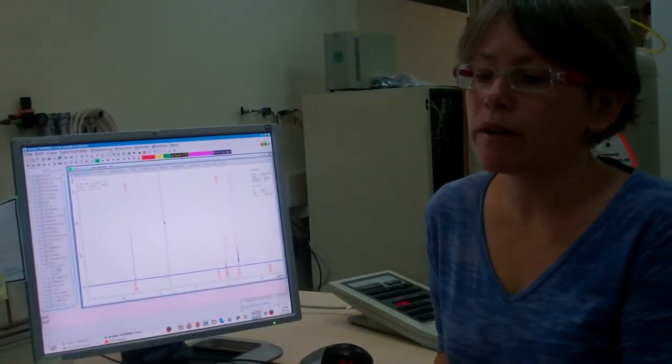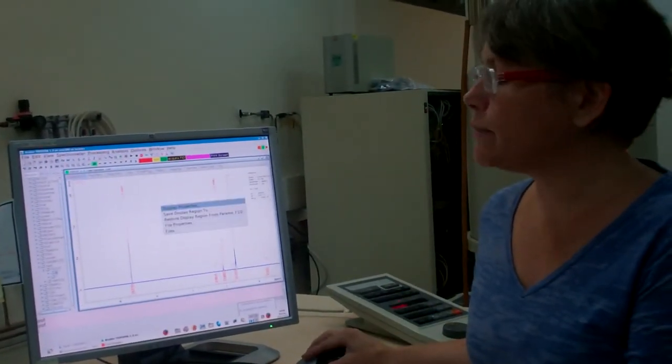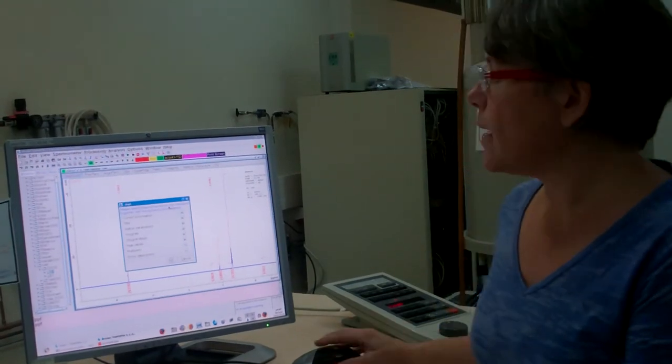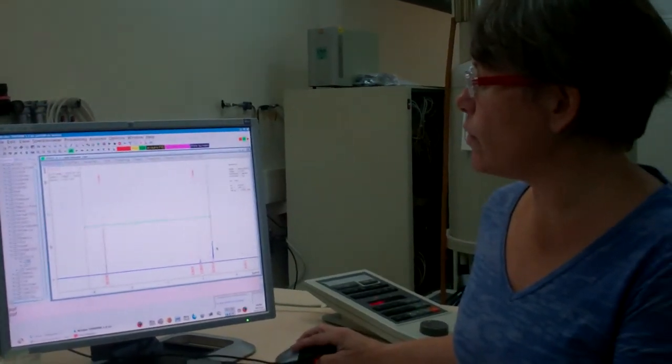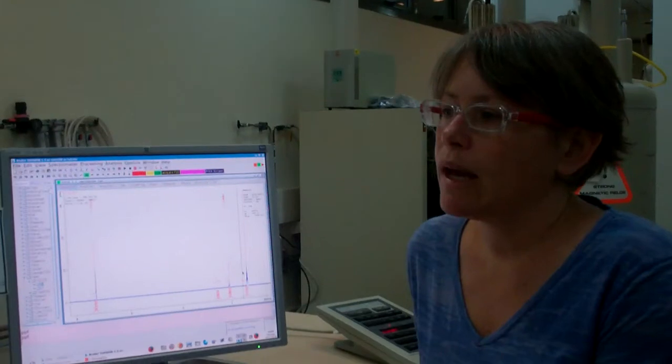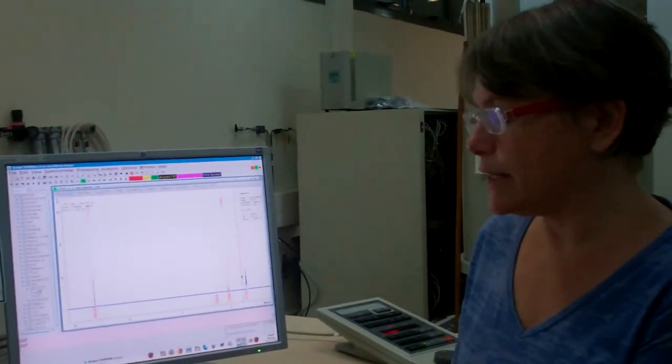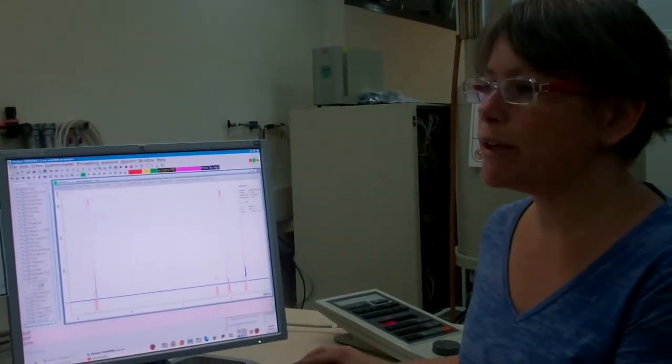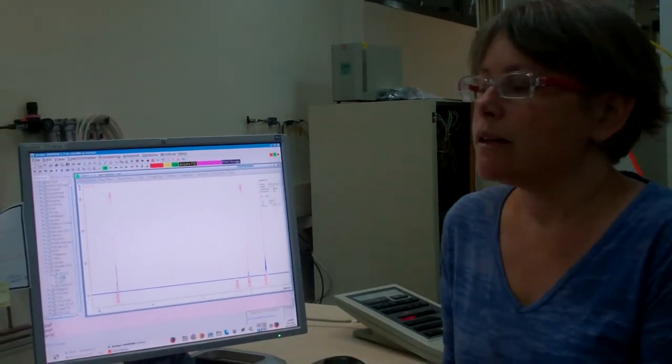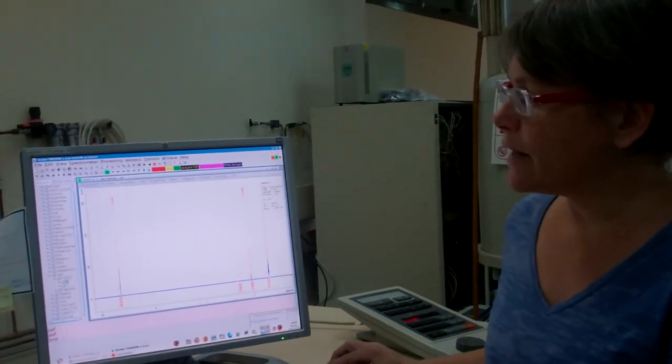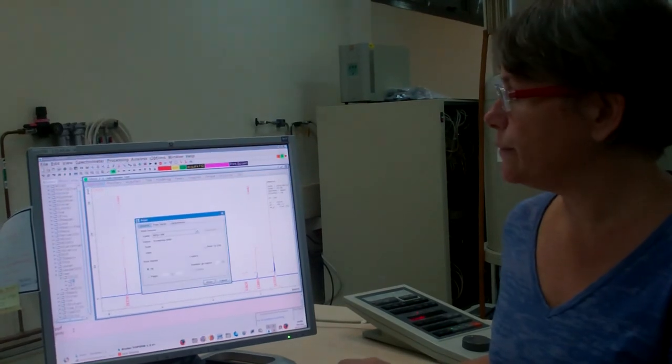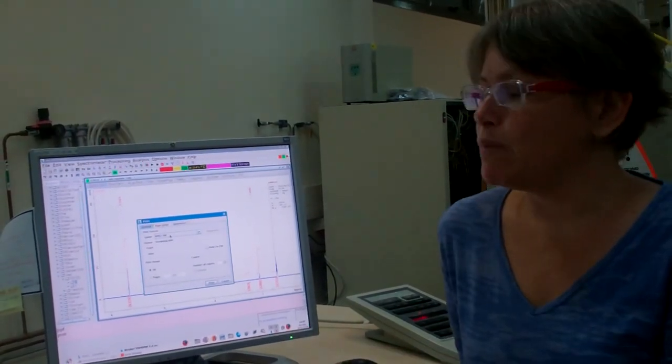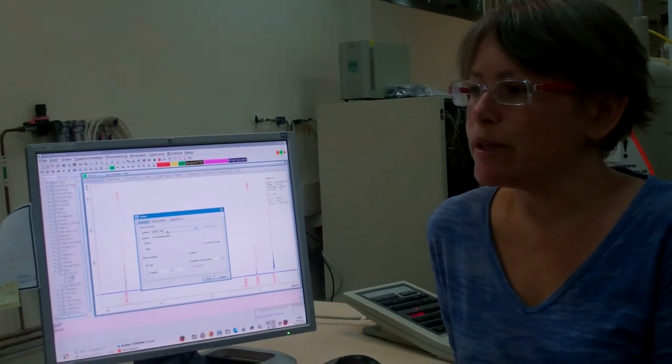Let me print a hard copy. I'll right click to display the title, integrals, peak picking. I can arrange things on the screen how I want. And now I can type PRNT, enter. Or I can just click on this print screen. To print from the command line, I type print without the I. Here the printer is the HPLJ2200.